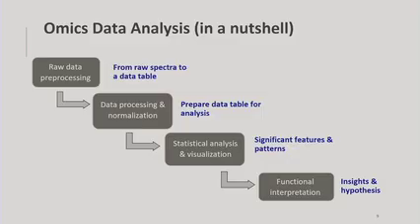So keep in mind that omics data analysis is always open-ended, and there's no fixed path. It is always driven by your own understanding. It's more exploratory, so independent target analysis follows this. If you apply very stringent requirements to omics data, sometimes it's just a misfit.